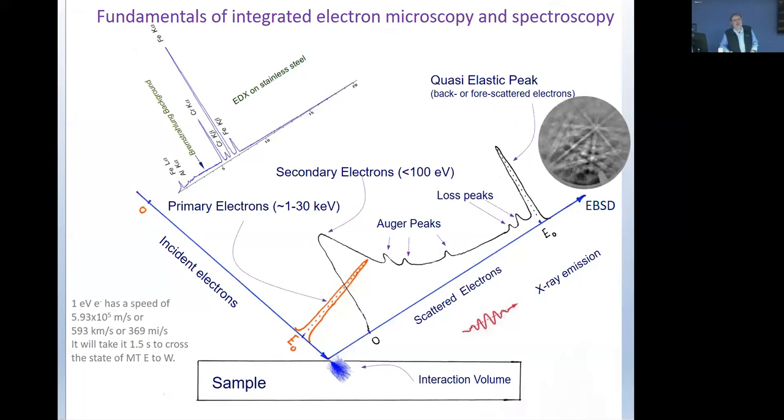When you do your chemical mapping, if you put a soft material under your probe, can you collect information like the carbon percentage, the hydrogen percentage? Not hydrogen. Auger can get information from lithium on up, every Z in the periodic table. But in terms of chemical mapping on these organic materials, I don't want to emphasize it too much.